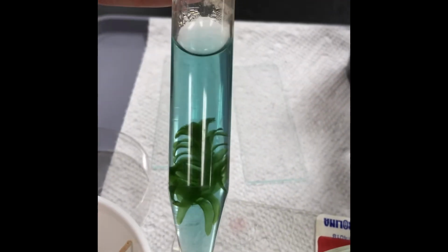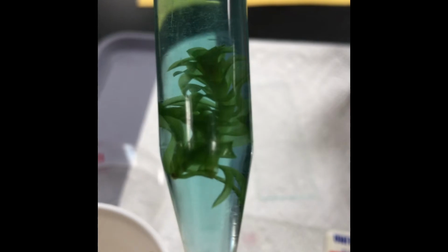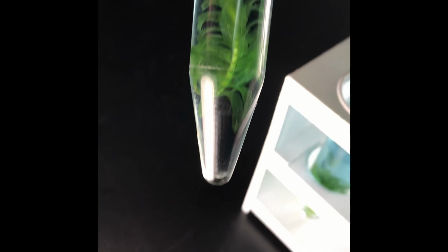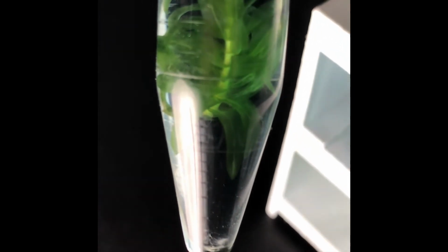This is tube A. Okay, so you'll note the color, make some observations. You need some quantitative and qualitative observations. Let me hold it up to the light and maybe we can see some bubbles. Hang on. Okay, here's an up close of tube A so you can get a better idea.